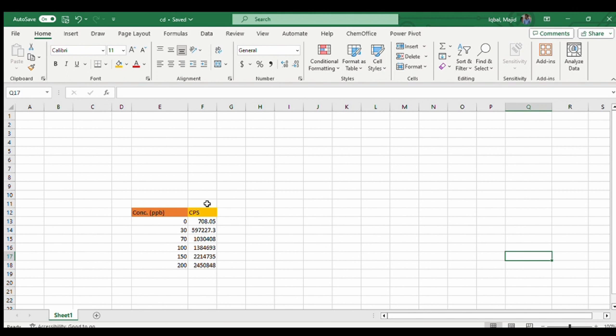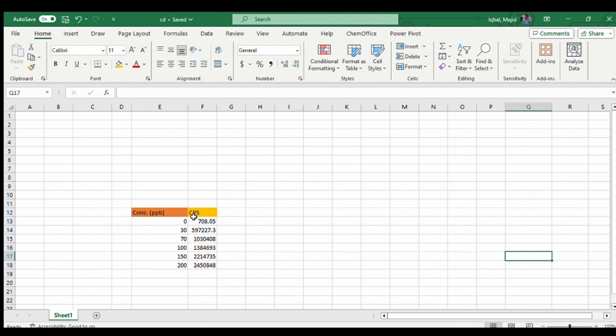I have two tables, one representing the concentration in parts per billion for cadmium, and that's the real-time data from ICPMS, and the CPS values, counts per second value. We are going to first construct a straight line graph and then from that graph we are going to discuss the equation of the straight line and R square value.